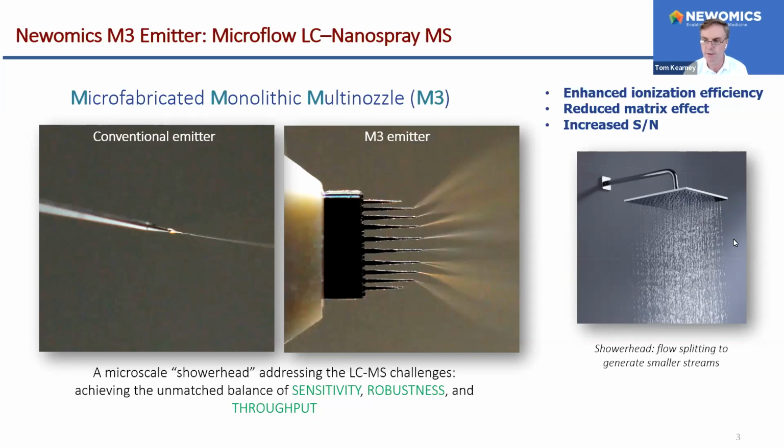The analogy is shown here of a shower head, where you have a stream in and then a lot of fine droplets coming out.